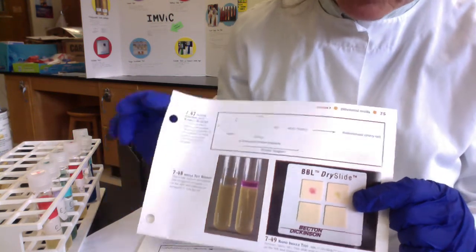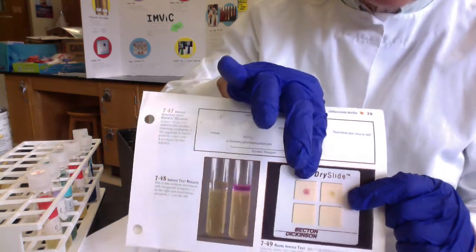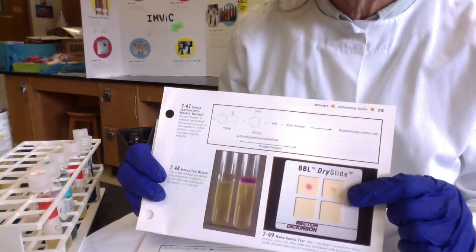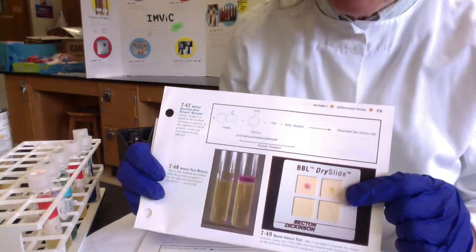So for E. coli, folks, remember, E. coli is indol positive, so we would get a pink result with E. coli. Enterobacter aerogenes was negative, so we get like a yellow result for Enterobacter aerogenes.